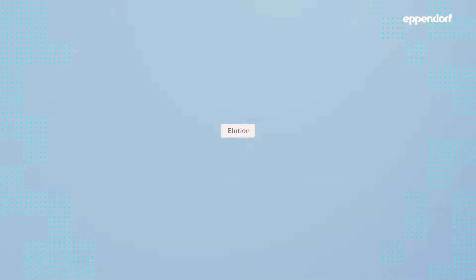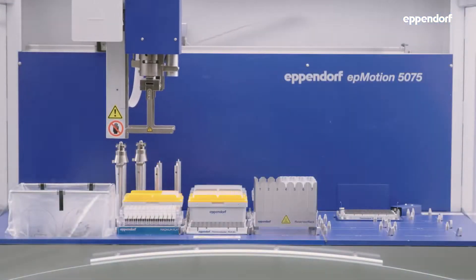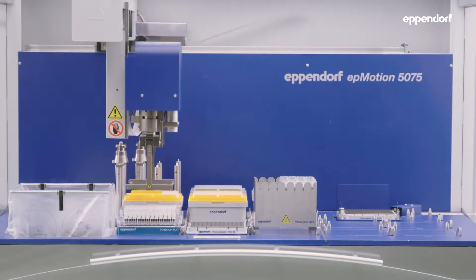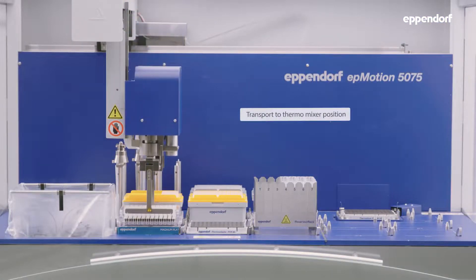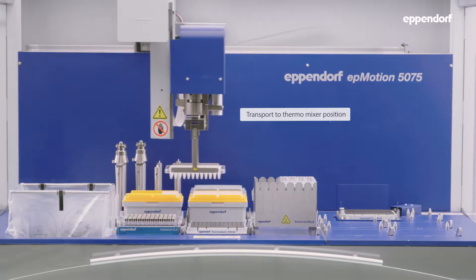The final step of the bead cleanup is the elution step to separate the nucleic acids from the beads. The sample plate is moved to the thermomixer position of the EP Motion that has a 96-well plate adapter.